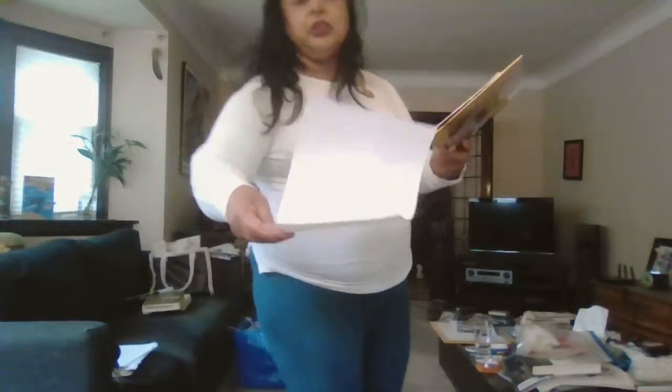That's what my reference says, but I took it a little close. So there could be a bit of a factor there, really close to the, as I showed you. Here it's a little too close, right on top, so you have to give a bit of a gap. And then that's the hyperbola.